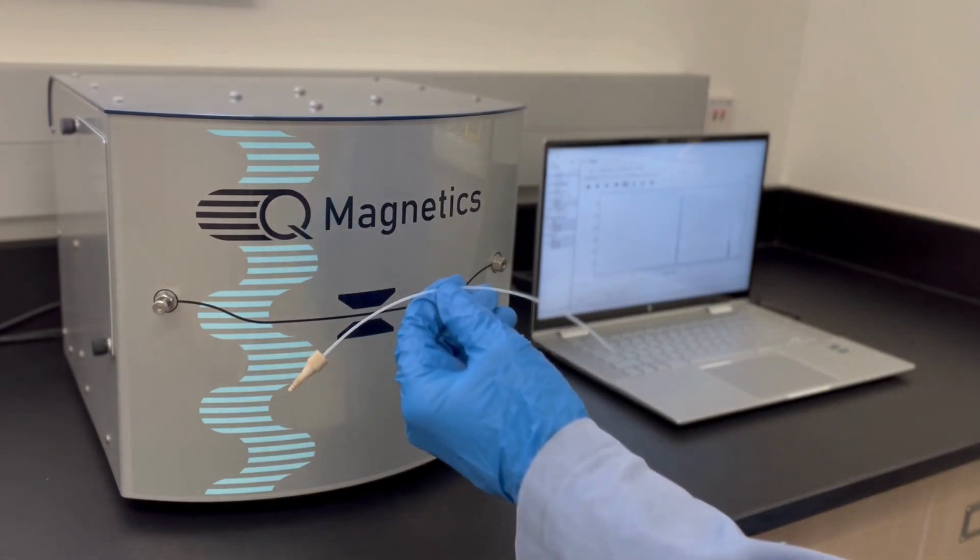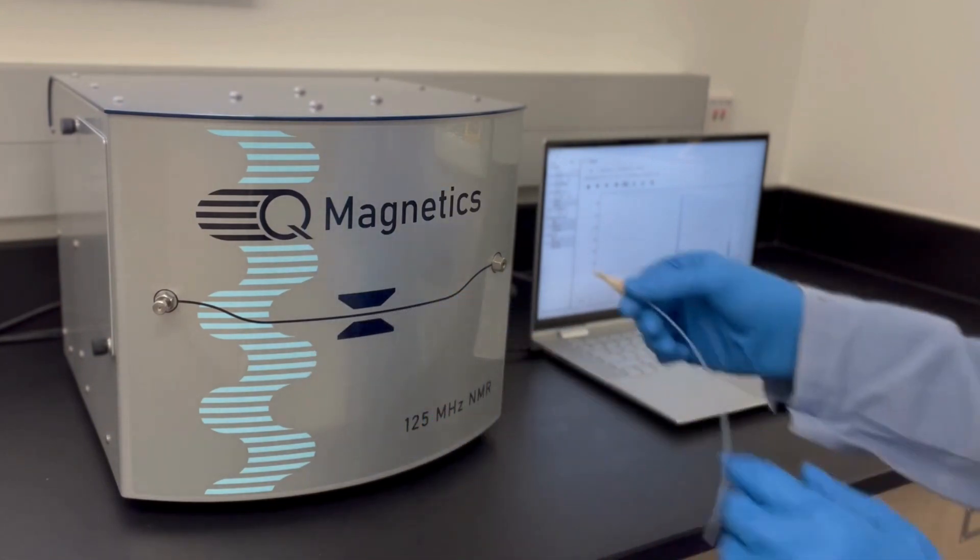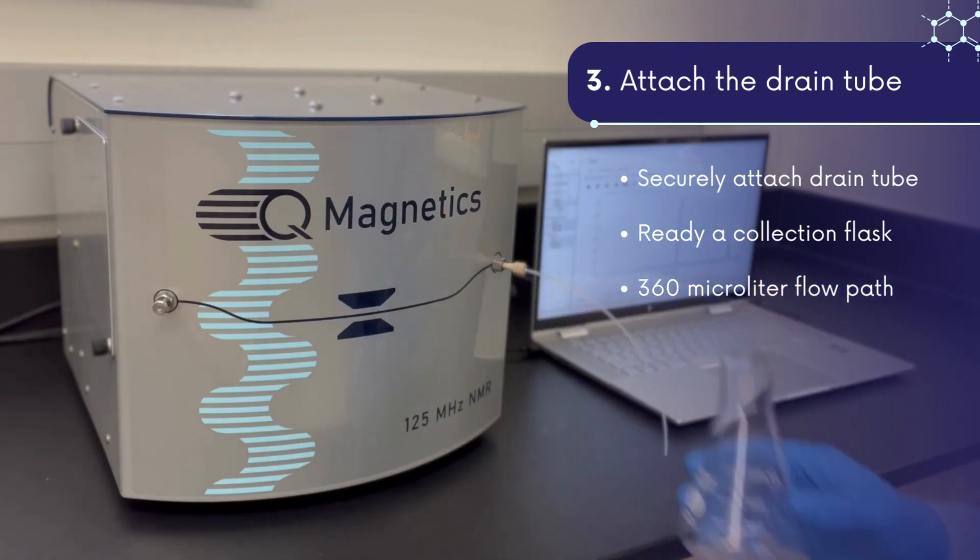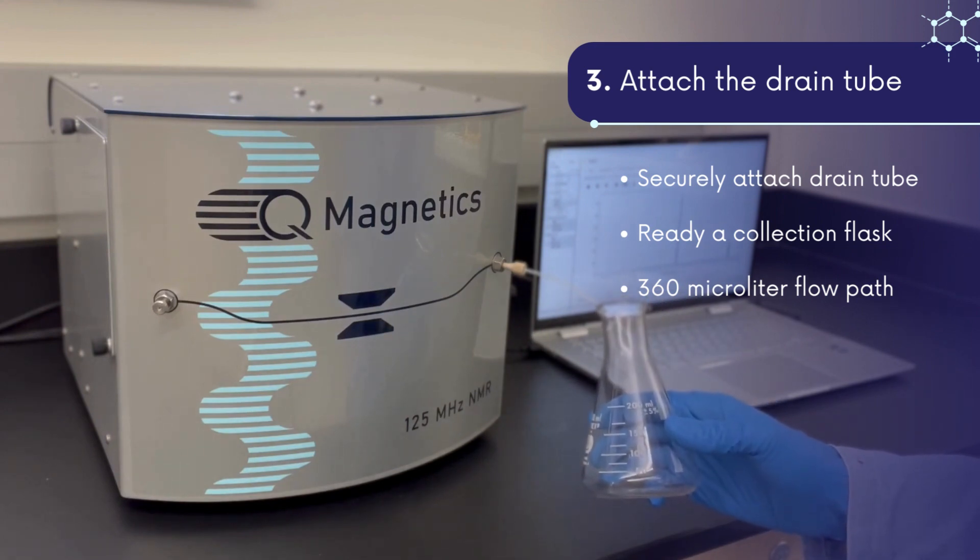Next, secure the drain tube to the other front panel fitting. When sample is injected, the drain tube will allow excess volume to run through the flow path and can be recollected or disposed into a collection flask such as this Erlenmeyer.